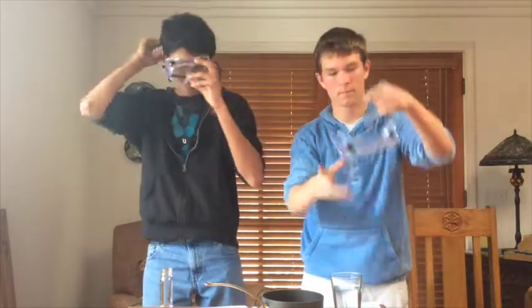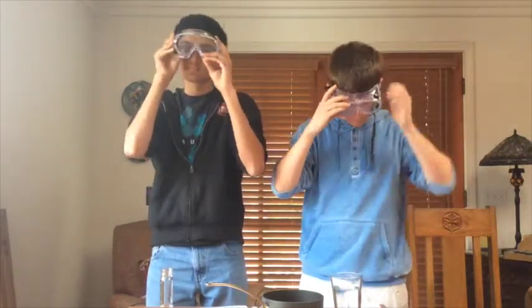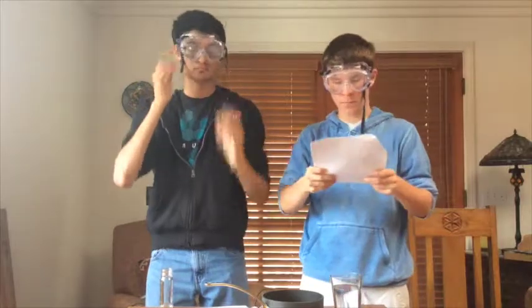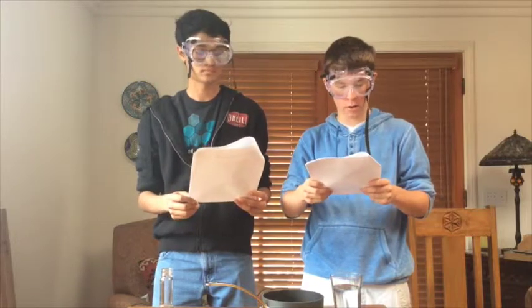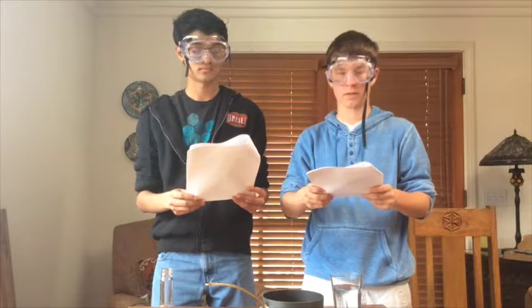First of all, we always need to have our goggles on when performing a lab experiment. In this experiment, there will be an open flame and hot objects. It is important to remember that many objects look the same no matter if they are hot or cold. Never feel an object with your bare hands to test if it is hot.